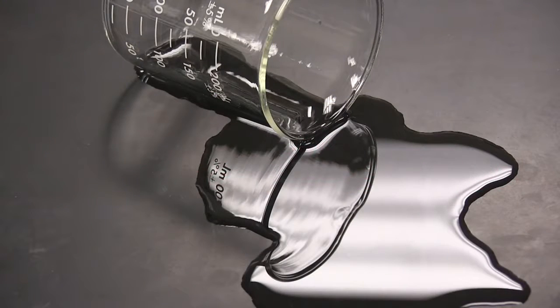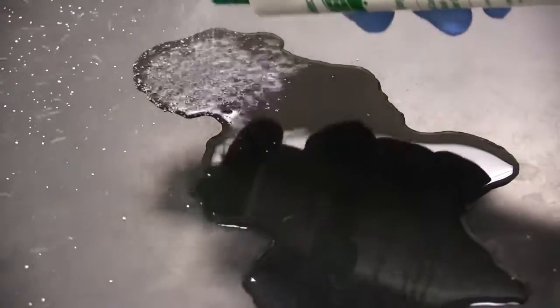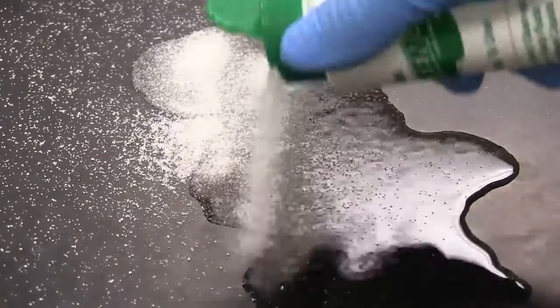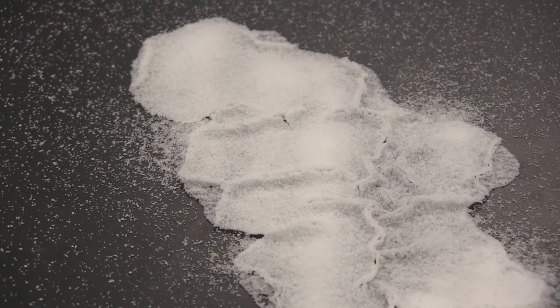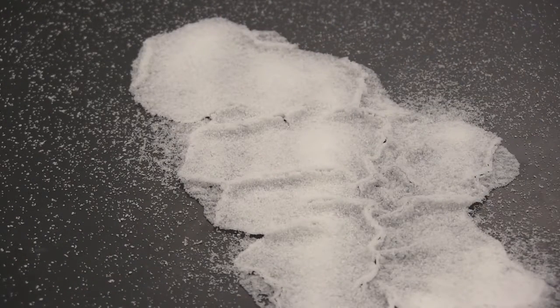After a spill is safely controlled, it is now easier for cleanup and disposal. An important reminder when disposing of any infectious and hazardous waste is to remember to do so in accordance with all local, state, and federal regulations.